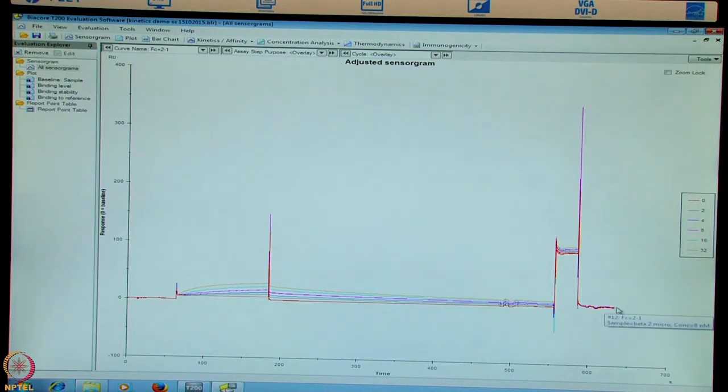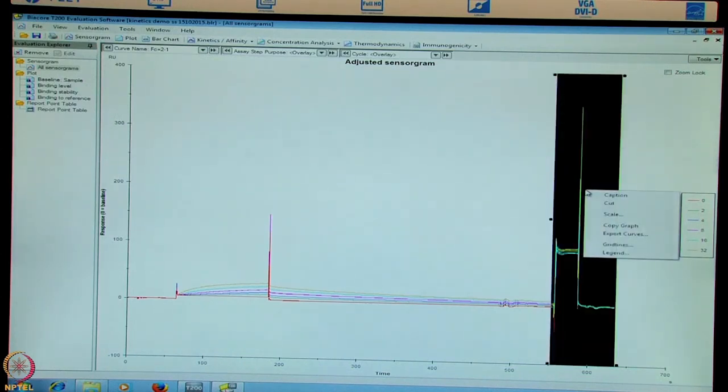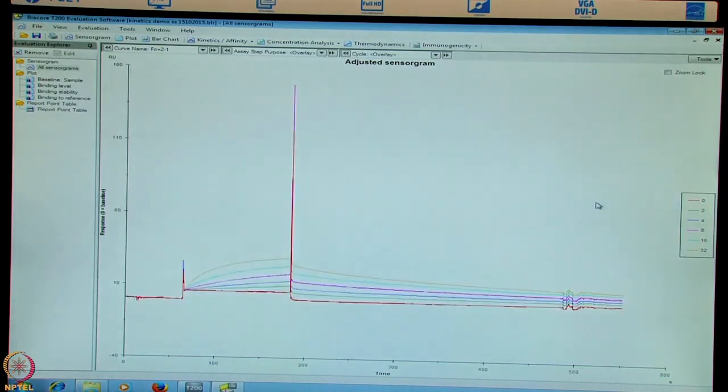Here as well, like binding, we will right click on the mouse and cut away this portion. And now this is our actual data with the different concentrations of beta-2M injected on the surface. To evaluate this data, we can go into the kinetic and affinity mode.